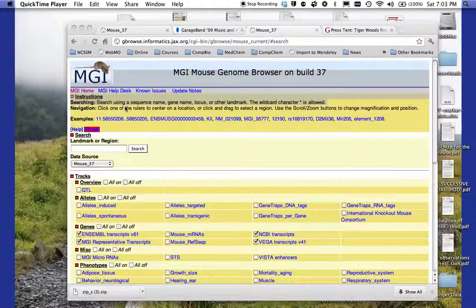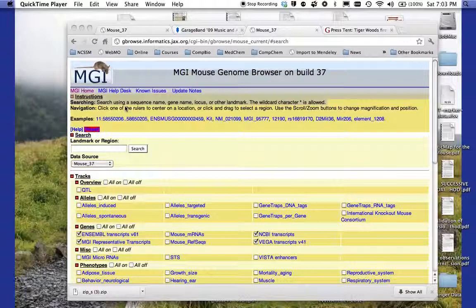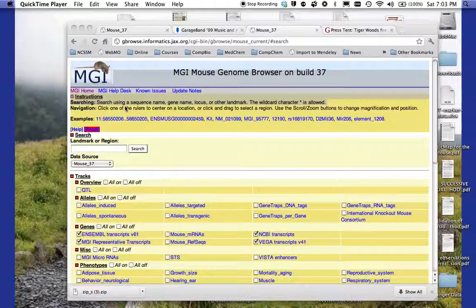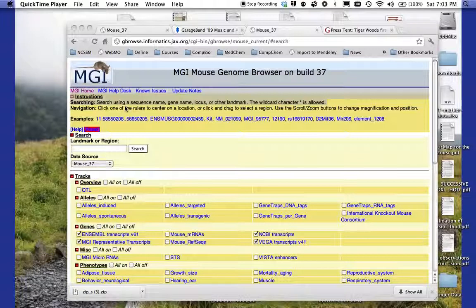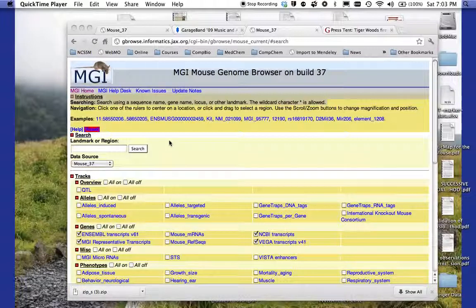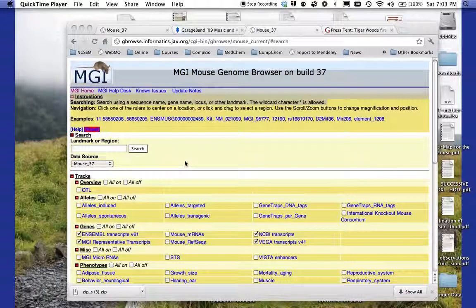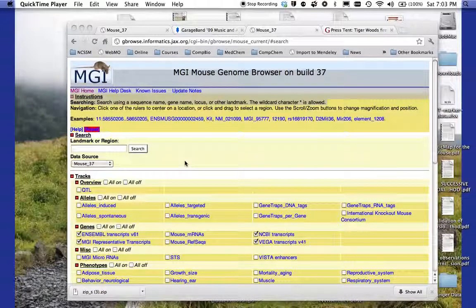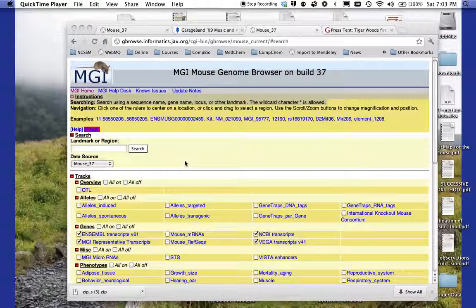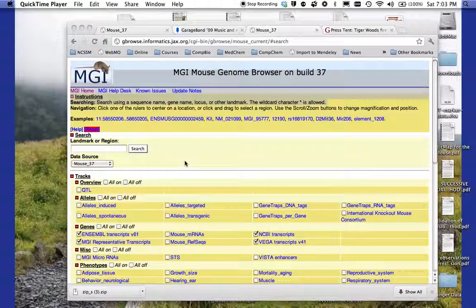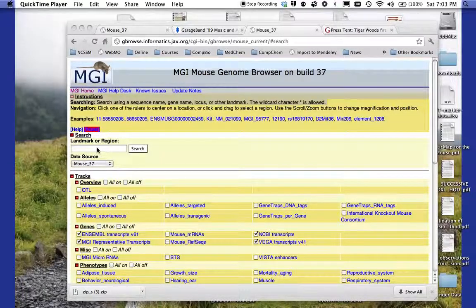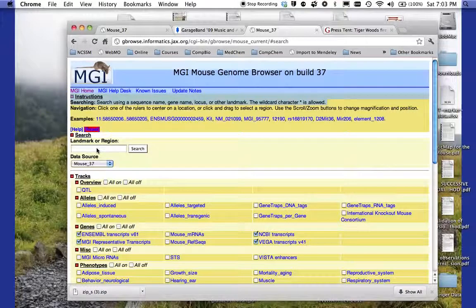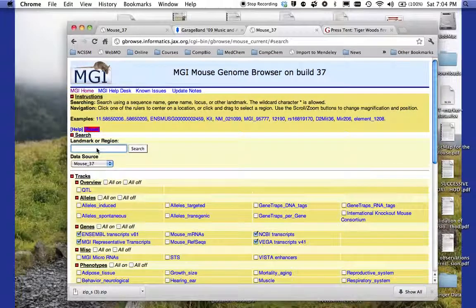Welcome to this five minute film on using the MGI Mouse Genome Browser. This is a tool for being able to find sequences on the mouse genome, assuming that you know the location of the particular region you're looking for, or a specific marker such as one of the DMT markers. We're going to look for a particular marker here.